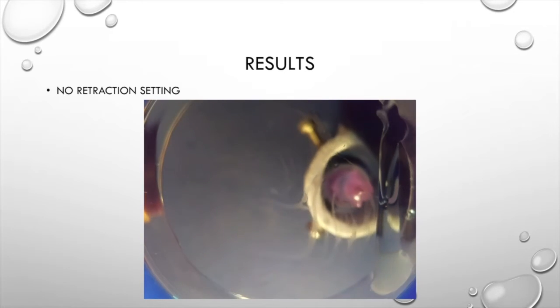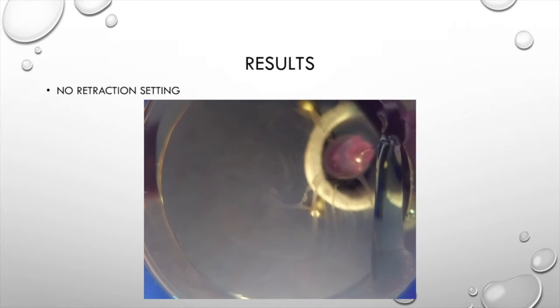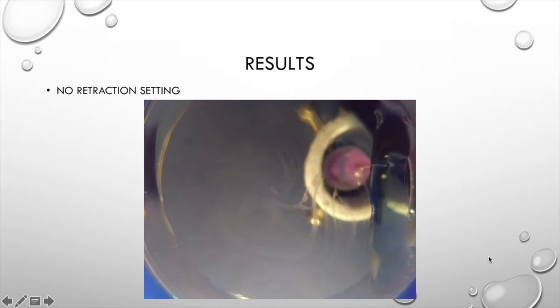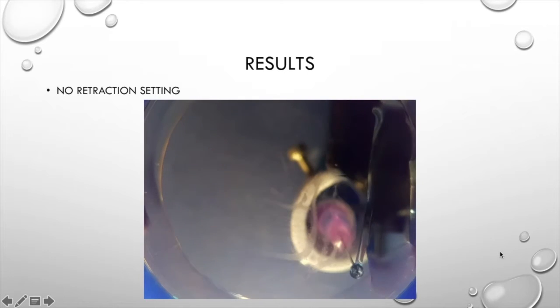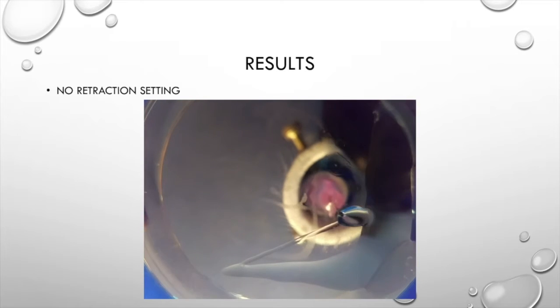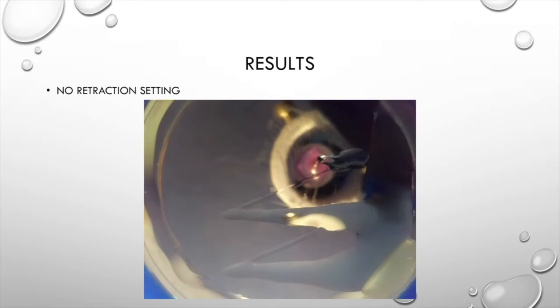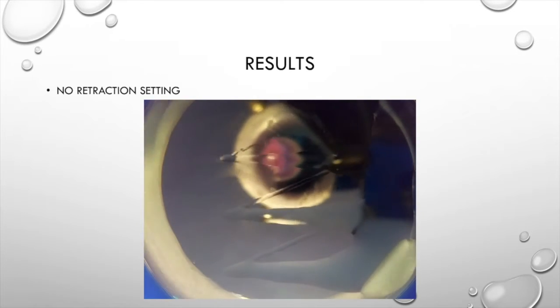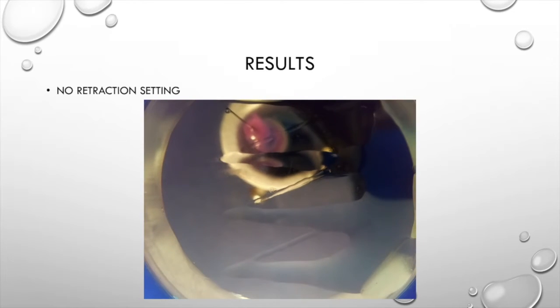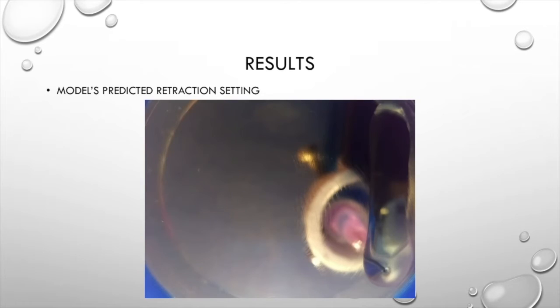Okay, this priming step is just making sure that when we print the 4 horizontal lines, we're modeling the middle of a print. And I'm just going to fast forward a little bit. So here's our last pass, and we're going to go to the horizontal lines. Now, it shouldn't be printing between the horizontal lines, but like we're about to see, we're going to drag a straight line of fluid due to the compressibility of the Bioink. You'll also notice that at the beginning of each line, we print a little bit too much, and that's exacerbated by the fluid combining with the primed line. But we don't tackle that problem in this. We just deal with the retraction setting.